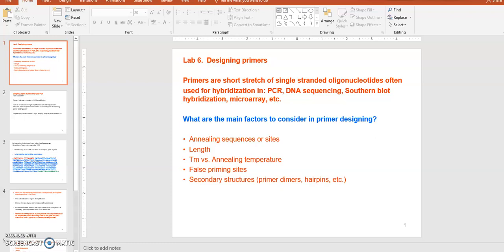Okay, so if that's the case, then you need to know how to make a primer. I guess you may not be making the primer, but at least you will be involved in the primer designing process. So your primer will have the correct DNA sequence. Not only that, a primer is required to have a certain melting temperature, so only your primer would bind to its target site and no other random site. And then your primer should have a certain length to be able to bind on the specific binding region. So it should be around 21 nucleotides.